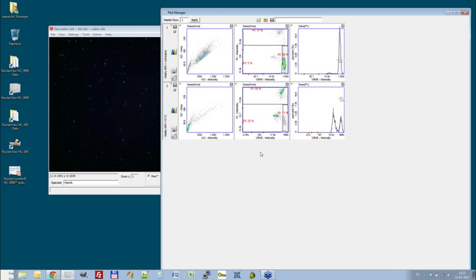And it's a 5-minute assay for measuring early apoptosis or cell health, and used also by production sites to follow their production of cells so that they can see if they are going into arrest or going into a low viability state. And by measuring this, they can, maybe 2 days in advance, see that the cells are going downhill and need some additives to the media.